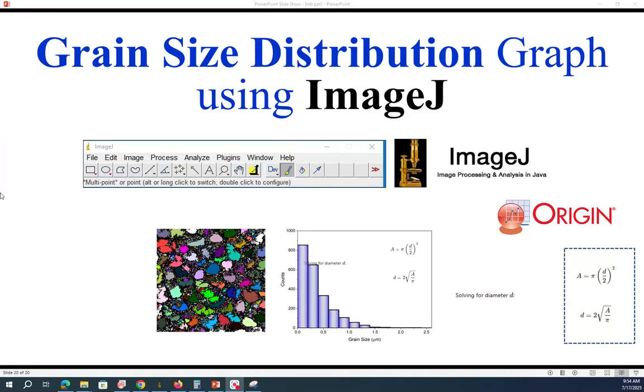Hello guys, in this video we will learn how to measure the grain size distribution graph using ImageJ. Grain size distribution is very good and much better than average grain size or grain size measured by the intercept method. This is an authenticated method which is used for journal publications and theses. The final graph looks like this.